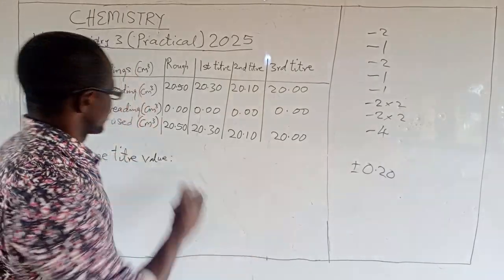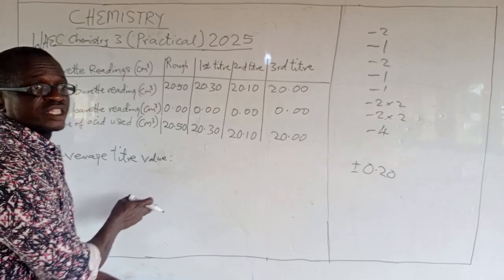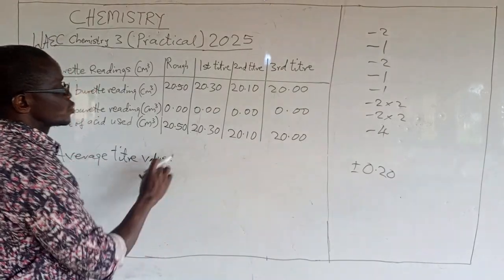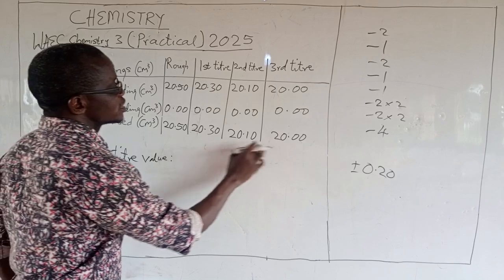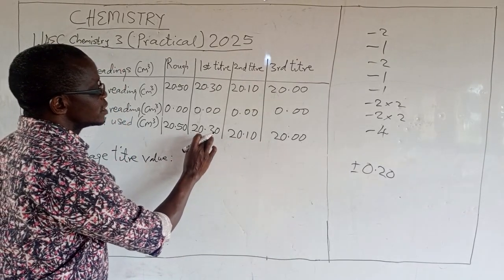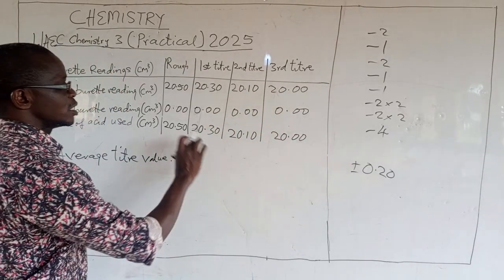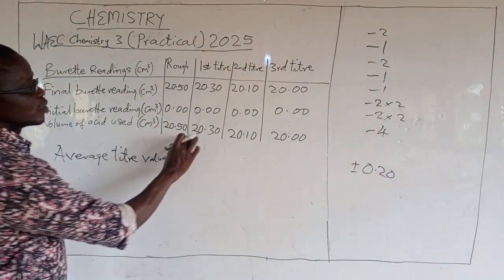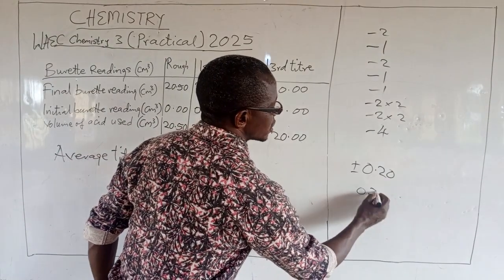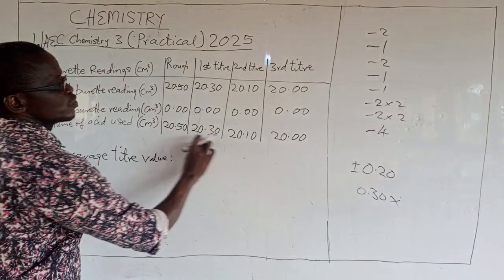But if I am using 3, averaging means add them, divide by the number of values you are using. So if I want to use the 3, this plus this plus this, divided by 3. Now, check the highest value among them and the least value among them. When you subtract, will they give you this? Subtract this from this. What do you have? You have 0.30, which is not concordant. You cannot use this 3. If you use this 3, you are wrong.